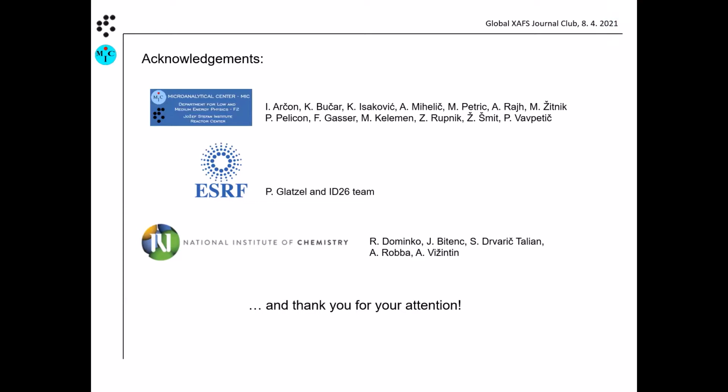Hi, Matjaz, nice talk. I just wanted to ask about the crystal that you are using, because you said you are using Johansson. For example, Jerry's group is using Johann crystal for tender XES. So how important is it to use that? How big is the Johann error? Is it really necessary? I know that Jerry is using it. So now the trend is to go, of course, to the small radius, because this really boosts the efficiency and everything gets much smaller. So I like this.